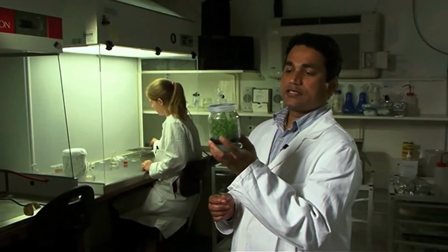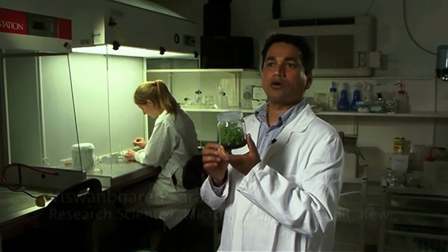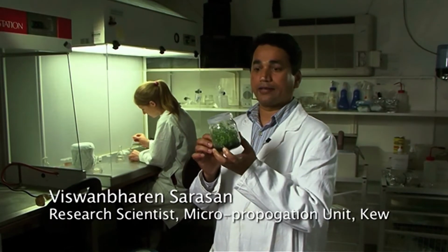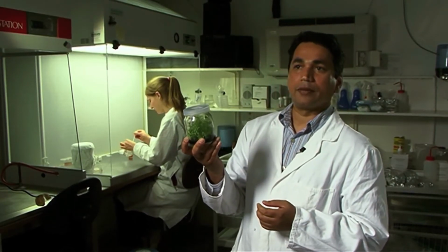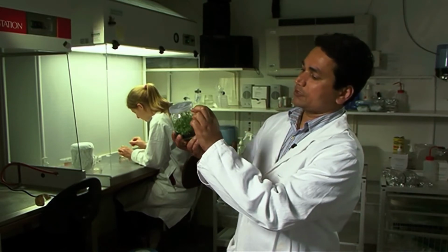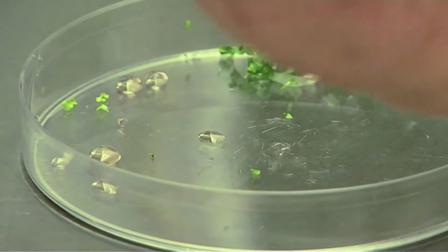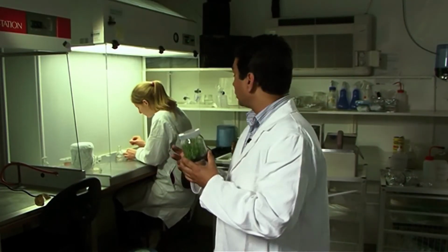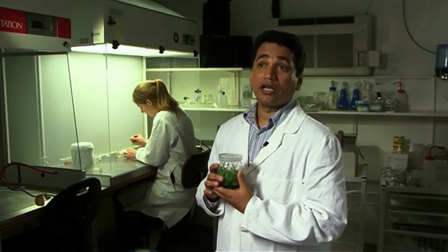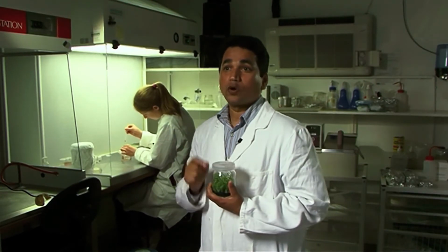And one of the important areas of research that we carry out in this building and also with our partners is understanding how we can keep those recalcitrant seeds alive for as long as possible. This is a jar of shoot cultures where we started off with small material and then multiplied. So there are a large number of shoots in this pot. So we can take a small piece of material. It should include a growing point, and that material is encapsulated in a bead. It's like a small globule thing.